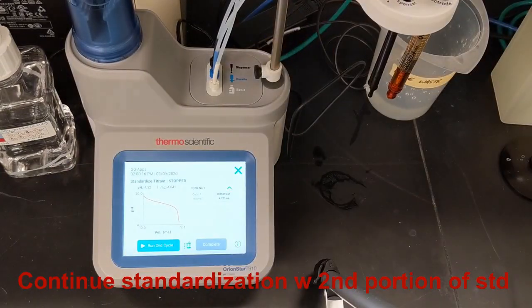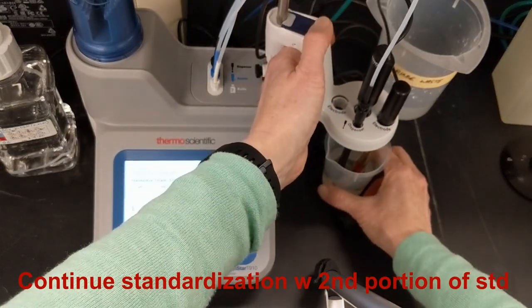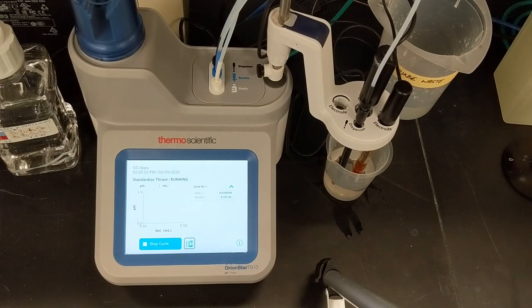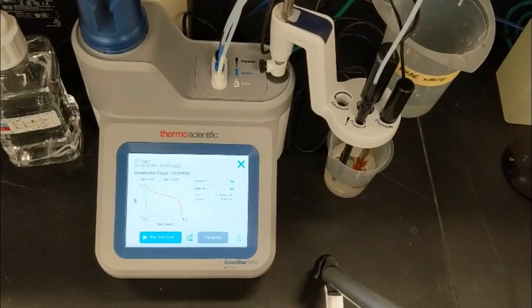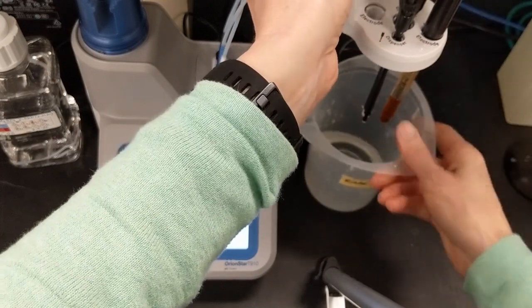Then I'll set up the second beaker of standard that I prepared earlier, and choose run the second cycle to start the second titration of the standard. As we saw before, the titrator begins the pre-stir, measures pH, and starts the titration. When the second cycle is done, the results of cycle 1 and cycle 2 are displayed. Since I'm going to run three beakers of standard for this titrant standardization, I'll rinse and continue.